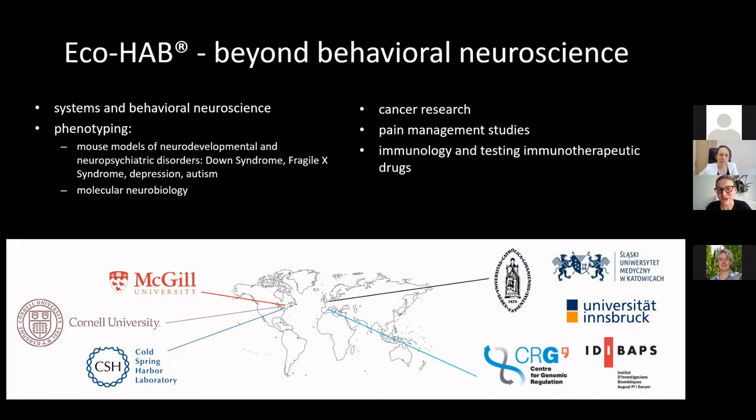The most exotic from the point of view of our own research is that Eco-HAB has already been used in cancer research, pain management studies, and I think most excitingly, testing immunotherapeutic drugs. So this is just a tool, and I think its capabilities allow us to use it in addressing many different questions depending on what you are interested in, but definitely its use can be way beyond behavioral neuroscience.